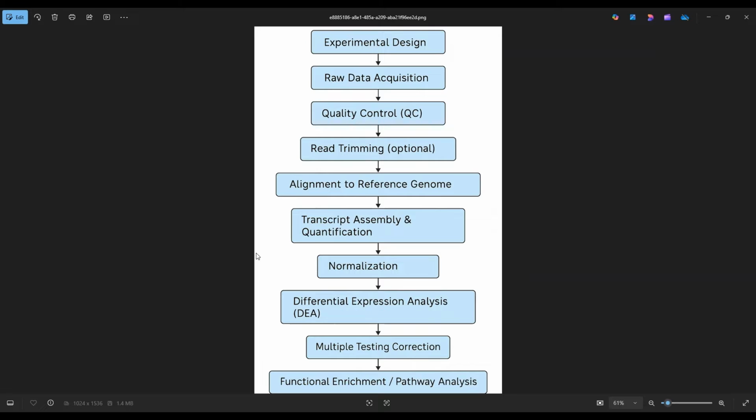And these raw files are very, very big files. When you talk about human genomes, they are more than 10 GB. If you're doing single-end sequencing, then maybe you have a smaller size, around 10 to 11 GB. But if you are doing paired-end sequencing, that would combine the forward and reverse, and one file of one cancer sample would be around 20 GB, depending on the sequencing depth or the coverage you are using. You can study separately what sequencing depth and coverage are.